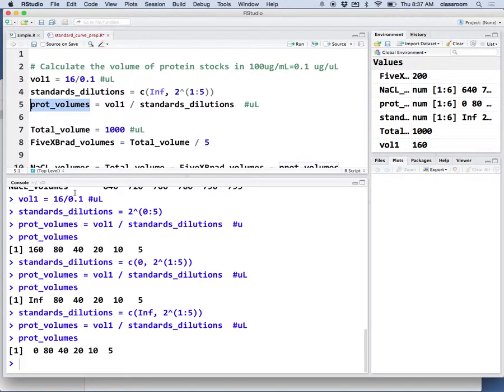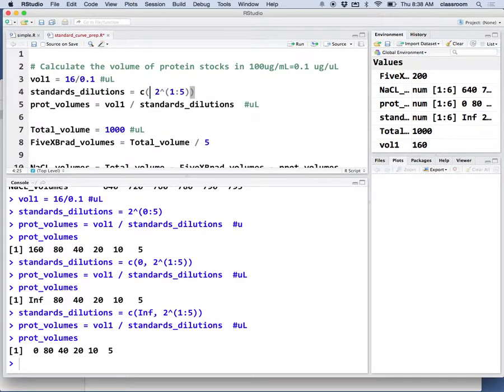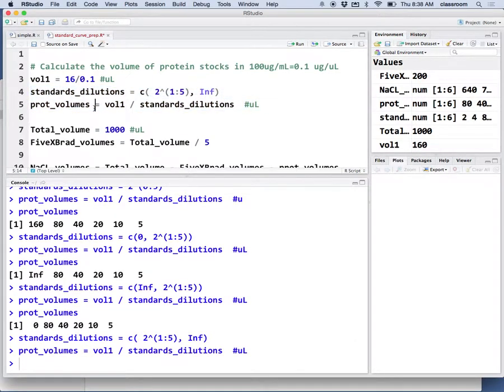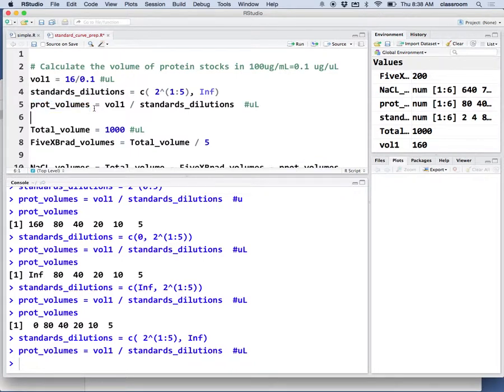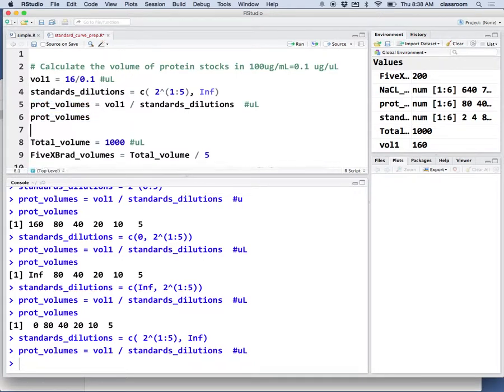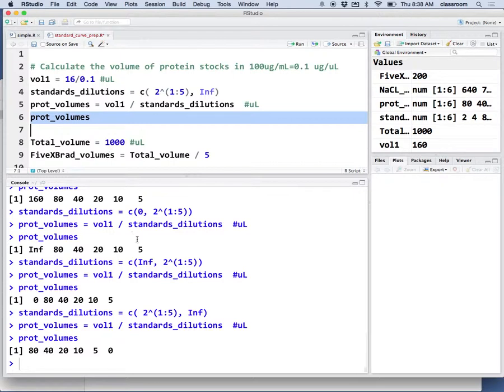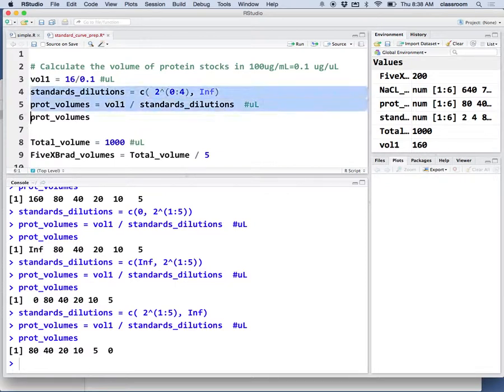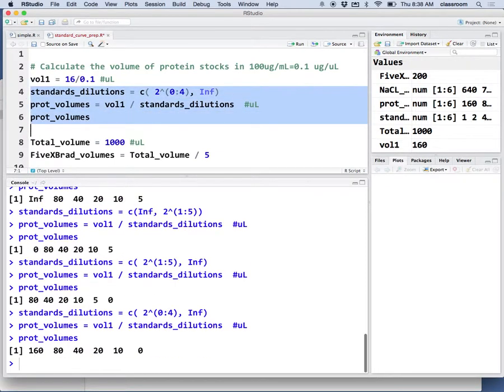I cannot make it the first one. It has to be the last one. The first one is 160. Okay, that's the correct answer now.